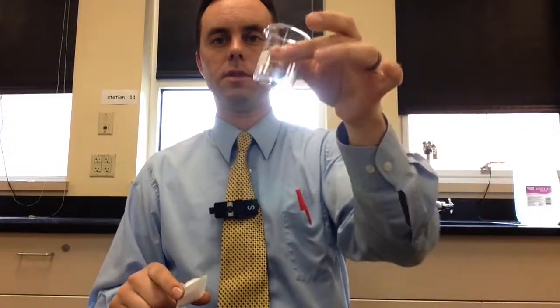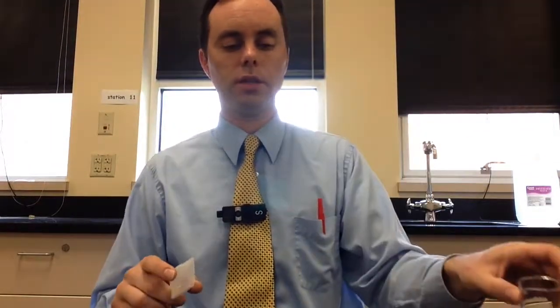So one of the first things you're going to do is you're going to put 3 grams of substance A. Substance A is the salt. It will be marked substance A in a little beaker at your table. You're going to weigh out 3 grams of substance A and put it into one of these containers.